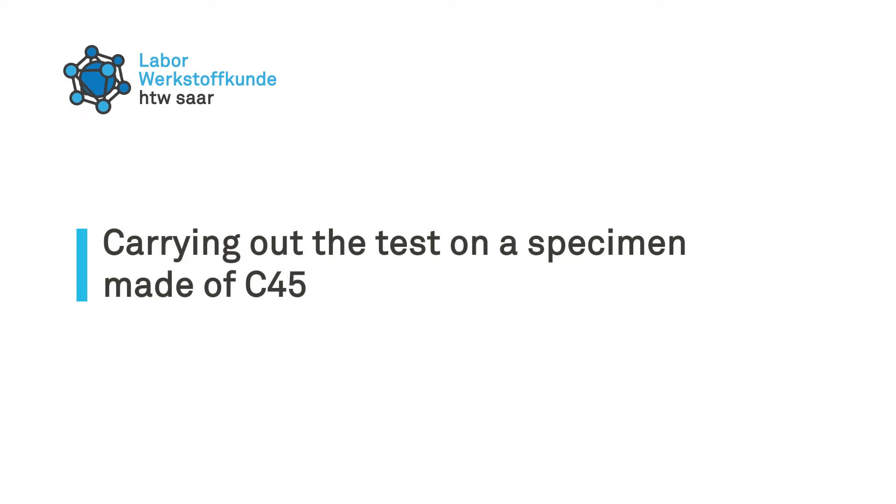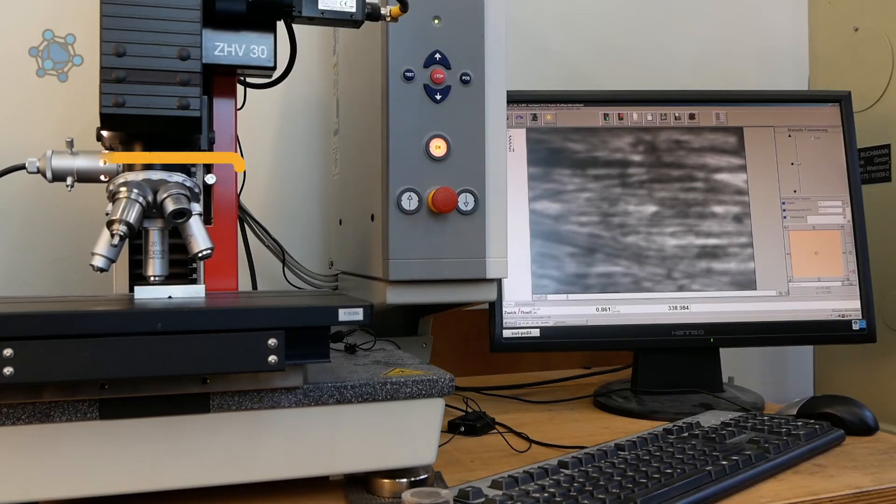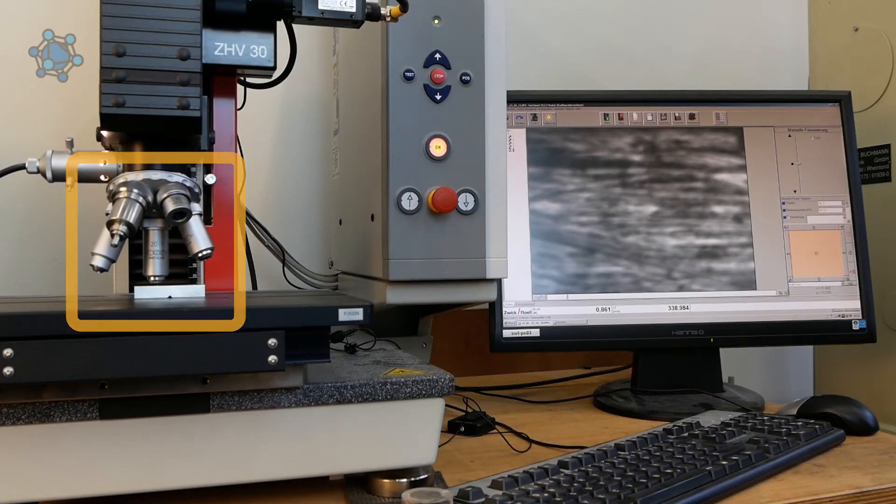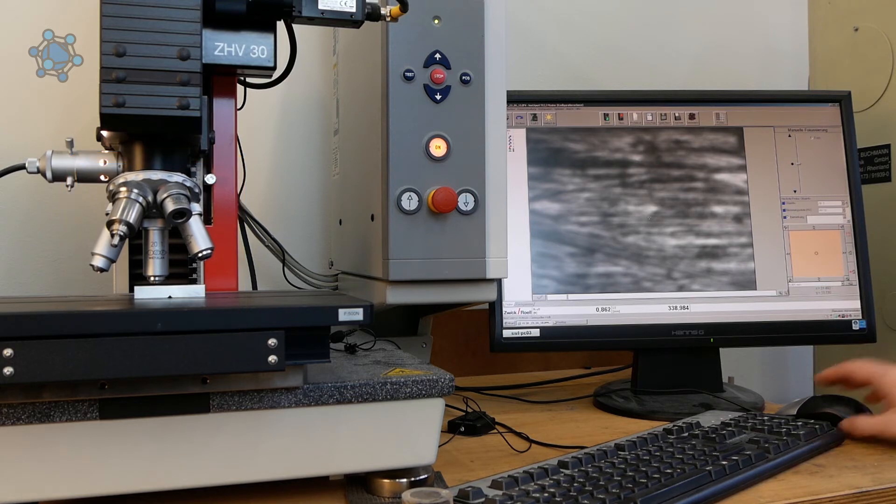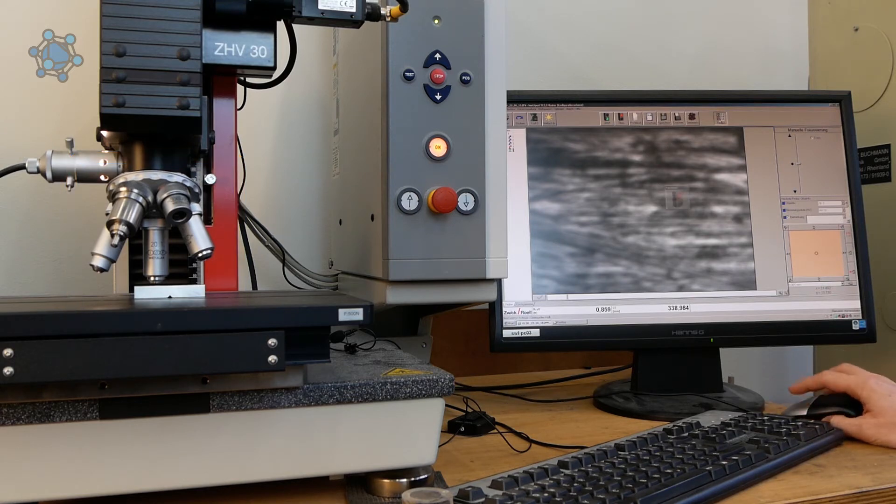The specimen to be examined is placed on the test table and aligned accordingly under the microscope. On the screen, it is now checked whether the camera image is sharp.